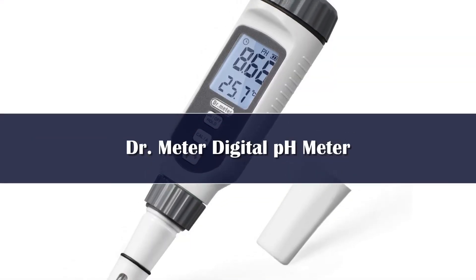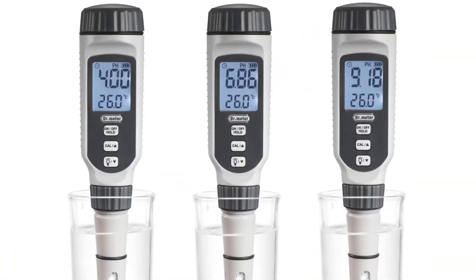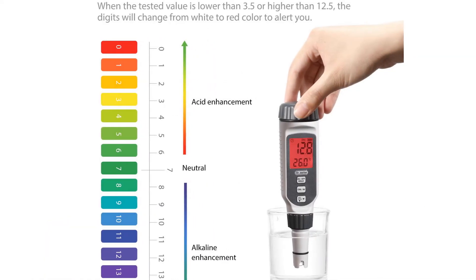Number 3: If your budget is a bit too low for the other pH testers on our list, consider this Doctrometer hydroponic pH tester. It tests both temperature and pH levels at a budget price. While not as fancy or specialized as some of the pricier options, the Doctrometer device is a reasonable choice.